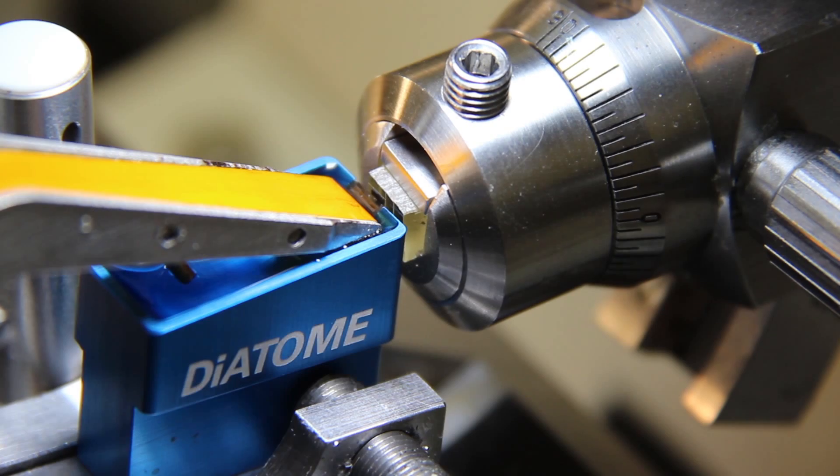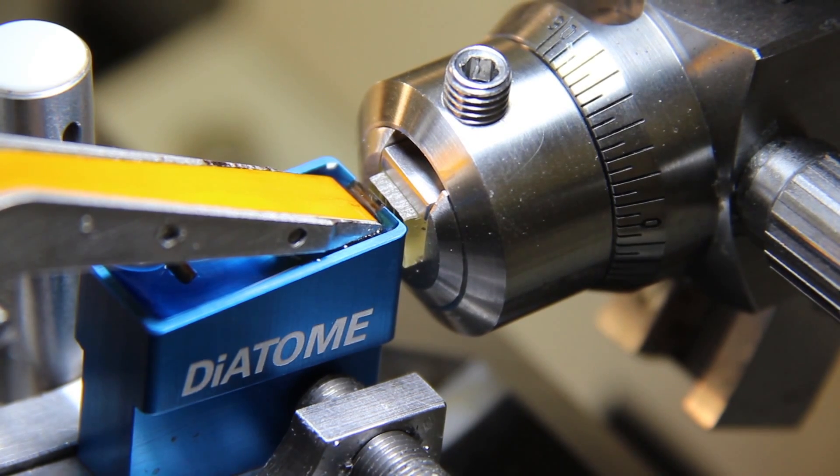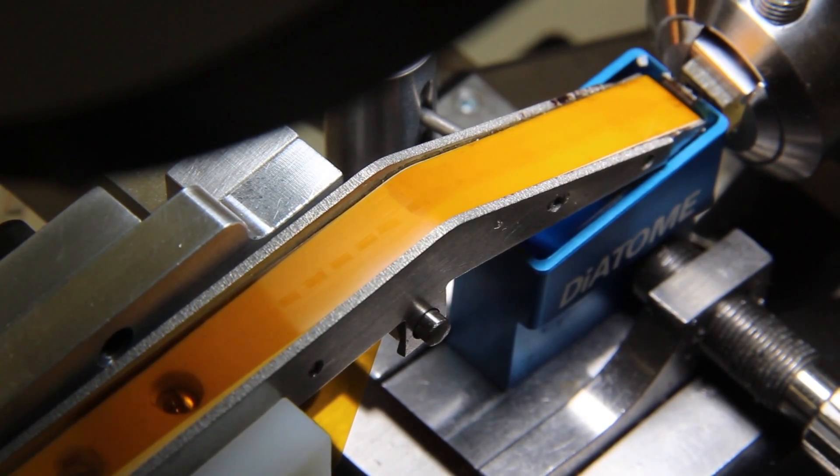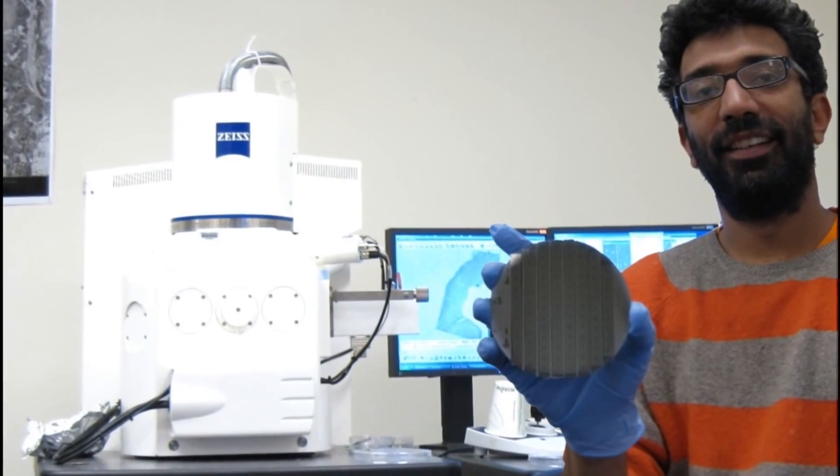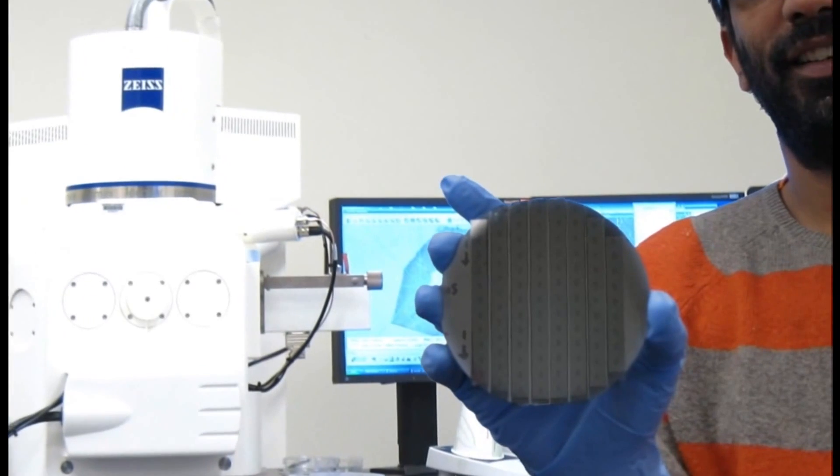So Ken Hayworth, together with Bobby Casturi and Richard Schalek, came up with a new method which they called ATOM, which stands for Automatic Tape Collecting Ultramicrotome, which picks up the slices as they come off the ultramicrotome onto tape. And we can then image these in a scanning electron microscope.